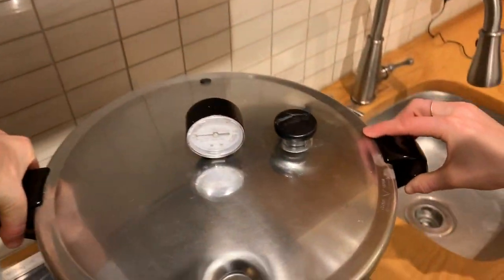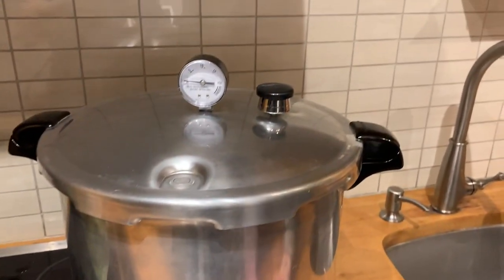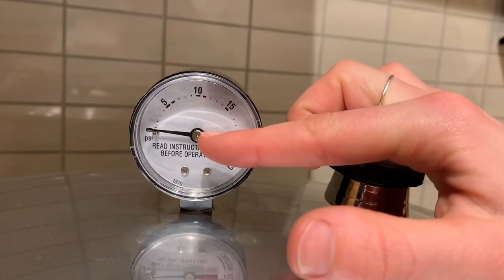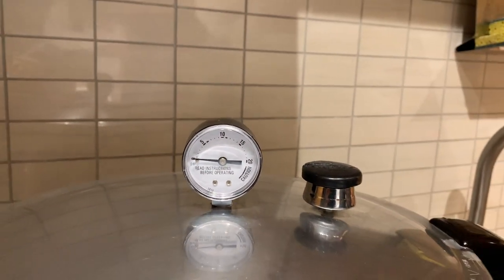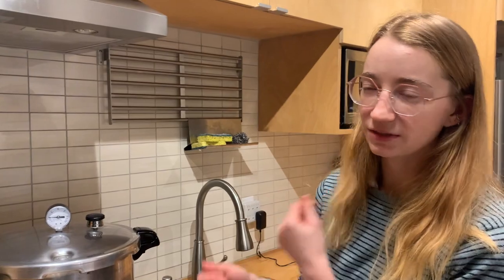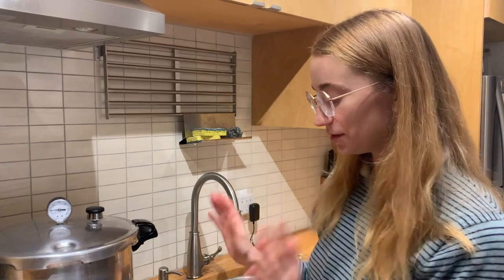Once all jars are loaded, put the lid on and close it. This will cook for 45 minutes at 15 PSI. The 45 minutes starts from when the gauge reaches 15 PSI — not from when you first start heating. Monitor the gauge, and once it hits 15 PSI, start your timer for 45 minutes. Then turn off the heat. Don't open the cooker right away — there will still be a lot of pressure and heat inside. Wait until it fully cools, at least an hour or more. Only open it once the gauge is back to zero.